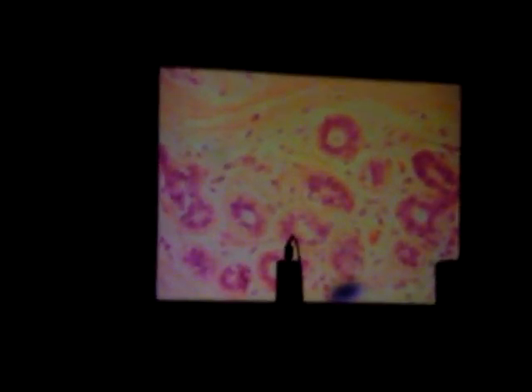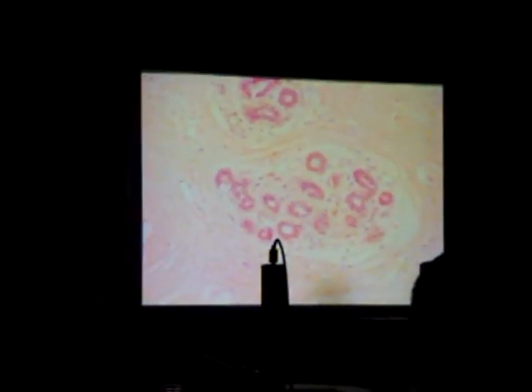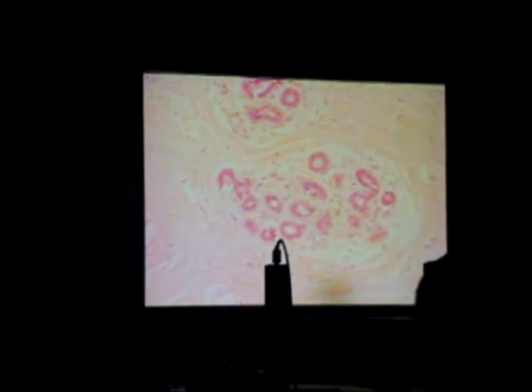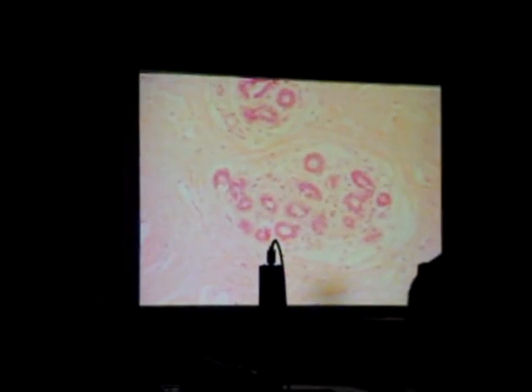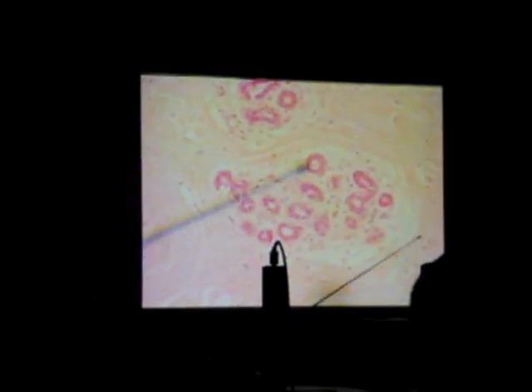What we want to key in on is right here — that's the key to the slide. That's where I'll be for the test, on that island right there. See that island? You need to know only two things: name the structure at the pointer tip, any one of those little purple things.